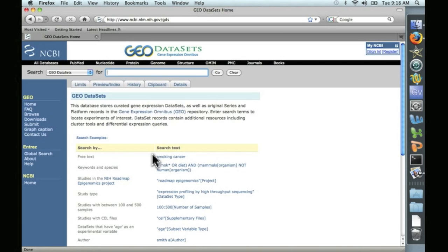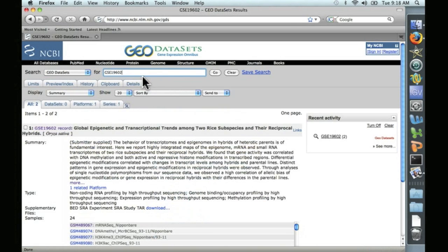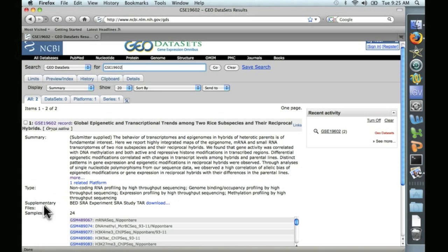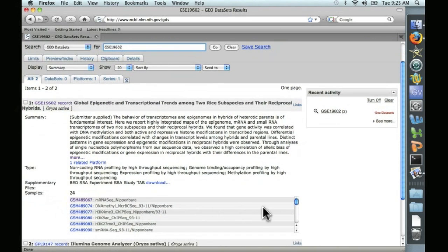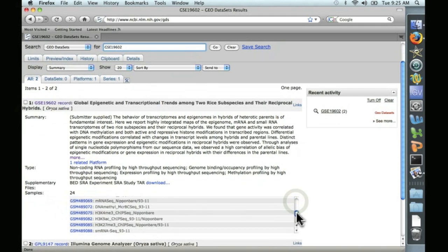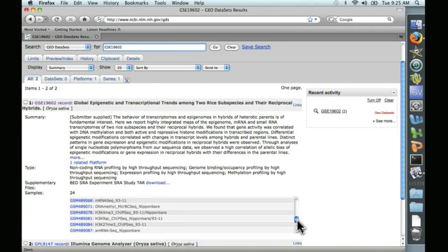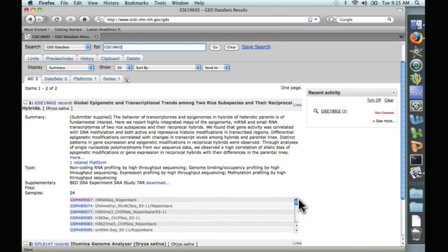This is a database that contains all kinds of microarray and sequence data sets. We'll go ahead and put in our accession number and hit return. And here's the paper that we were just reading. And down here, you can see supplementary files, and there's a list of 24 sets of files that you could download.